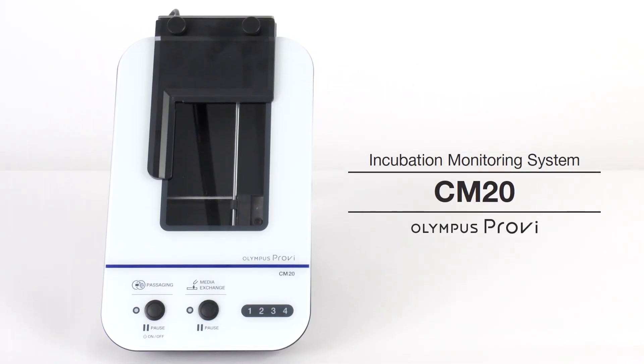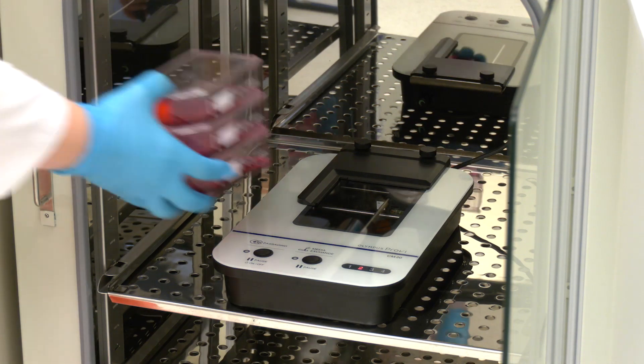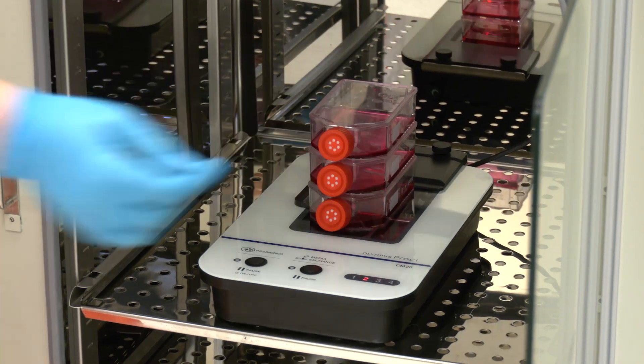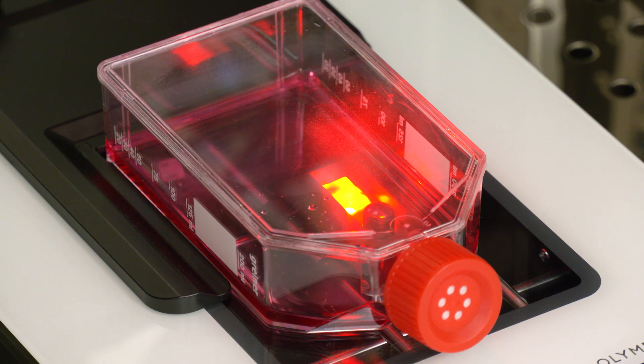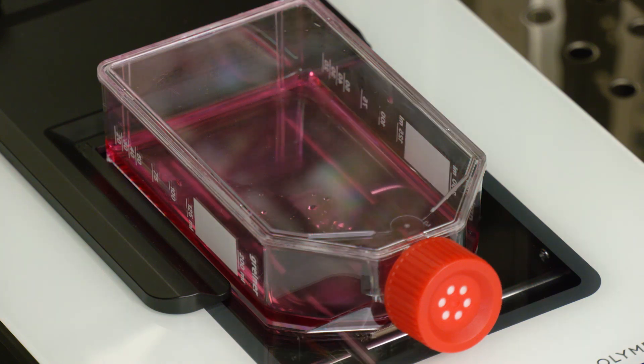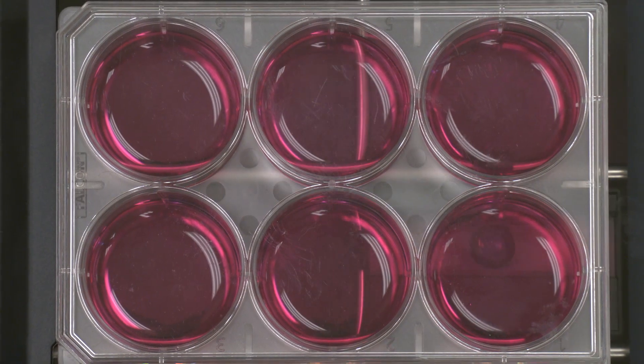The CM20 monitor can simplify this workflow and lead to a more consistent result, saving both time and money. Just place the imaging head and the cultures in the incubator and the system will remotely image, do cell counts, and determine the confluency. With the CM20 monitor, there's no need to label, stain, detach, or even remove the cultures from your incubator.